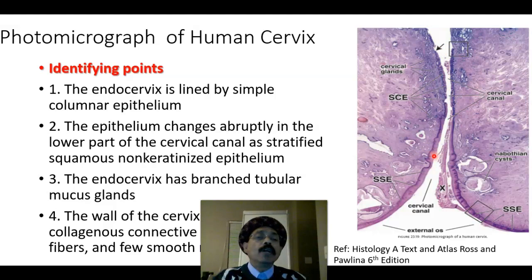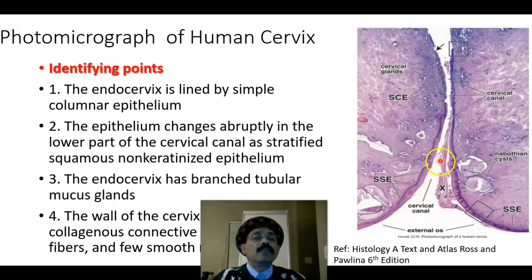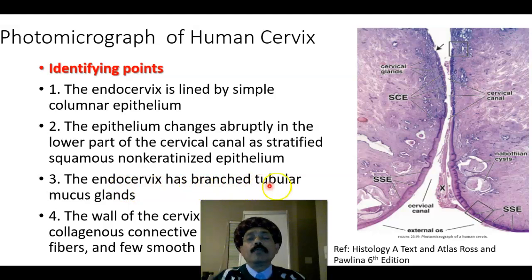In a young lady the junction is a bit lower — the junction between the columnar epithelium and the stratified squamous epithelium of the vagina. This is the ectocervix area; this is the external os, through which it is continuous with the vagina. The vaginal epithelium is stratified squamous non-keratinized epithelium. In this postmenopausal specimen, the junction between the stratified squamous and columnar epithelium is at a higher level than in young ladies.